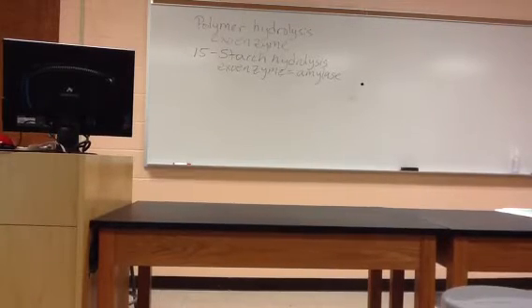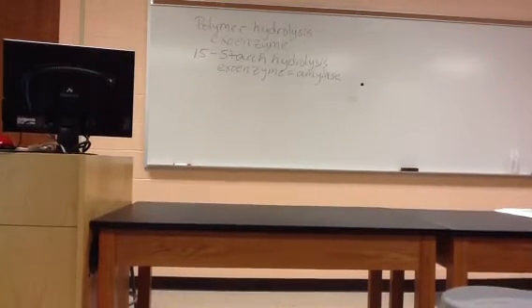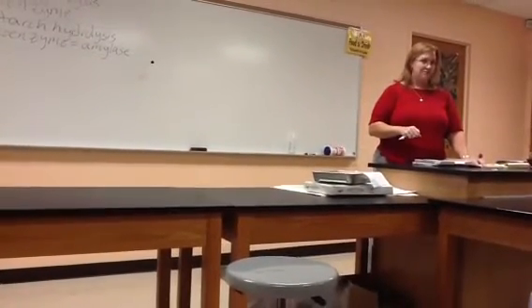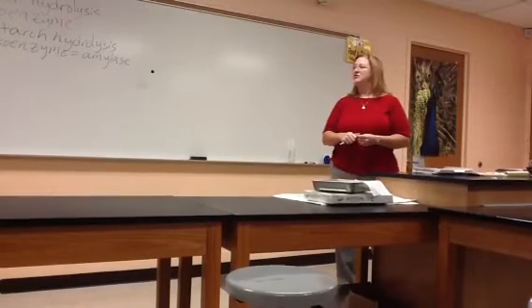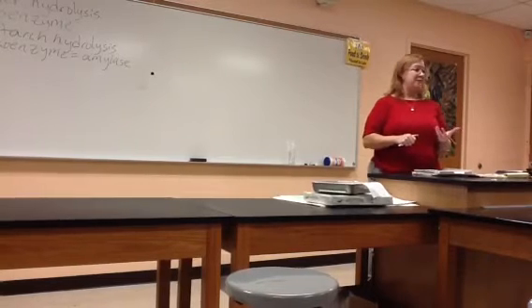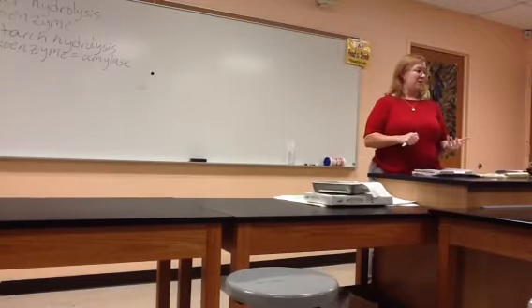Now, not every bacteria can make amylase. Some bacteria can produce it, some can't. That's the point of this test. We're going to be looking at the bacteria listed on page 100 in your material section. We've got Bacillus subtilis and E. coli. Page 100, material section. So we're going to be checking those two bacteria to find out whether or not they produce amylase. Do the bacteria produce amylase or not?